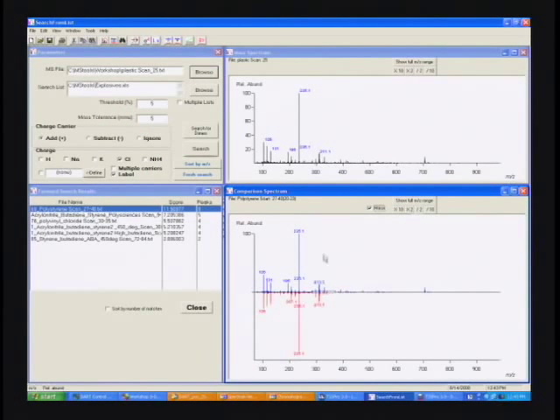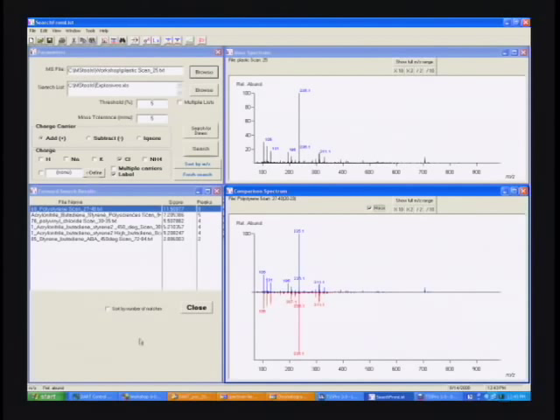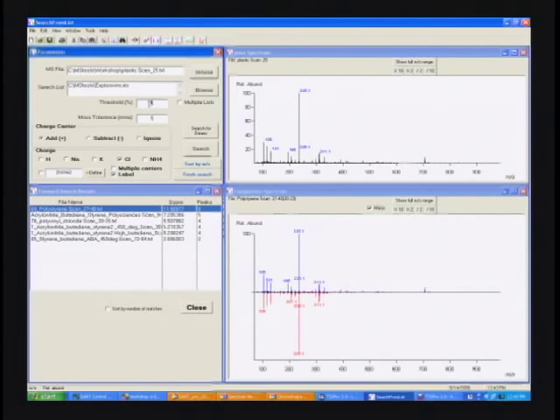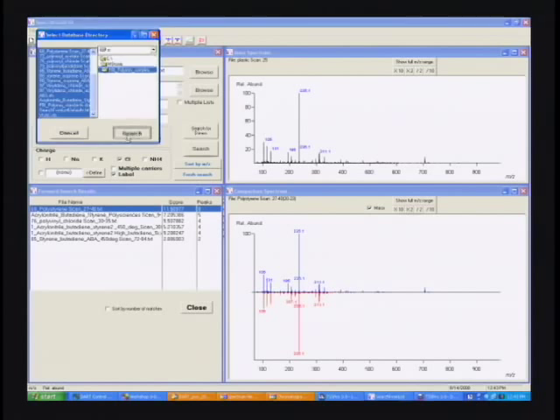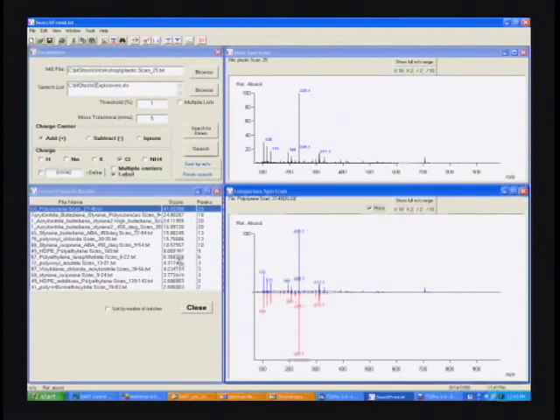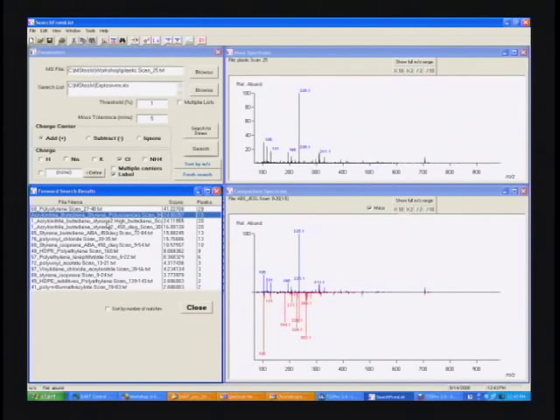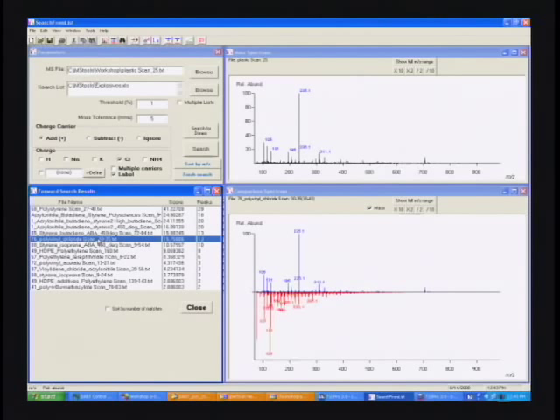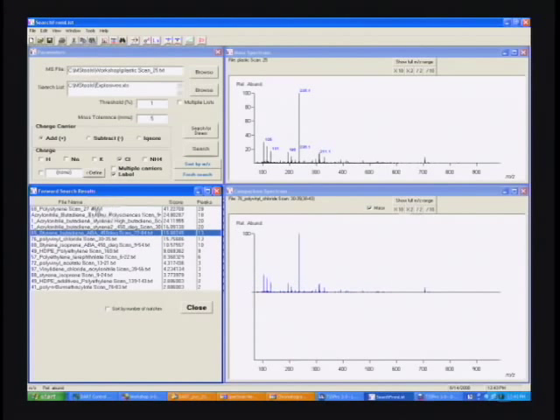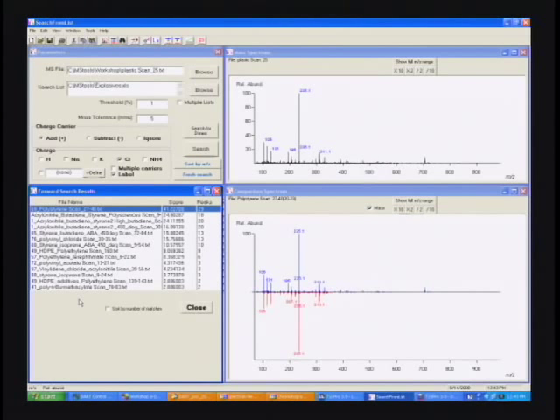And if you look at the bottom, the mirror spectrum, you see the 105, the 119, the 131 peaks, the 235 peak. All of these things line up nicely. We could lower the threshold and probably match a few more peaks. But the best match is clearly the polystyrene peak. If you compare this, the next best match is there are other things that have styrene in them, like acrylonitrile butadiene styrene, styrene butadiene polymer. And then you get the things that don't have styrene in them. You see the patterns don't match at all very well. So we're able to identify exactly which polymer this is, and that's correct. If you look at the label here, you see this is recyclable, and it's got a little six with a triangle around it, which means that it's polystyrene.